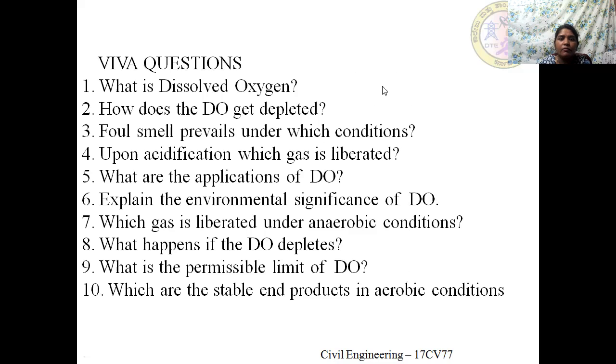Let us move on to some Viva questions. So what is dissolved oxygen? How does the dissolved oxygen get depleted? Foul smell prevails under which conditions? Upon acidification, which gas is liberated? What are the applications of dissolved oxygen? Explain the environmental significance of dissolved oxygen.